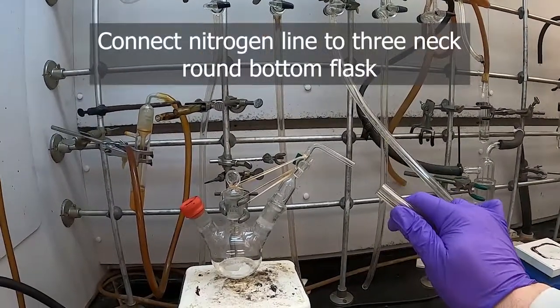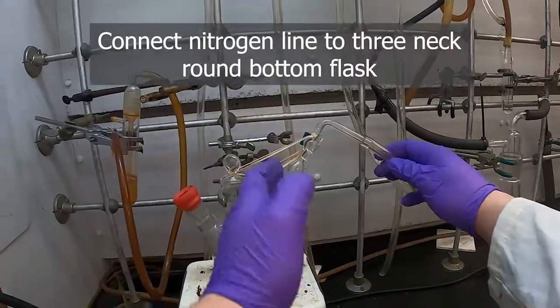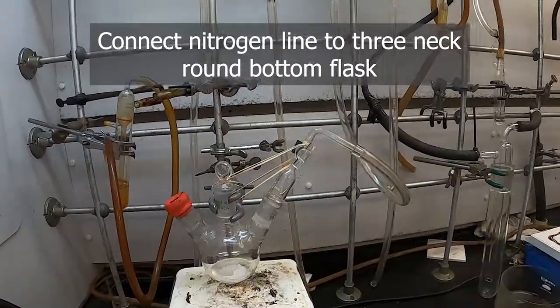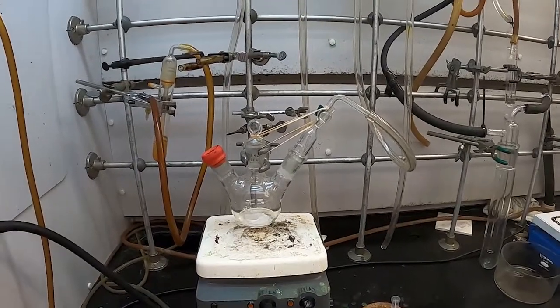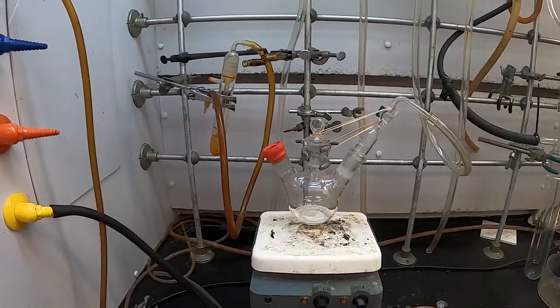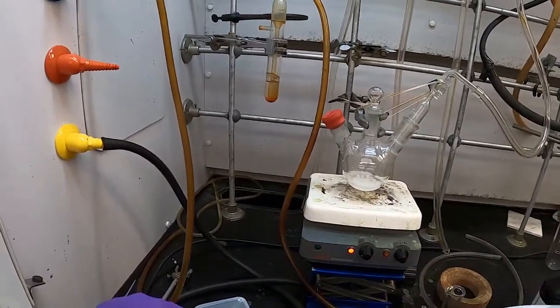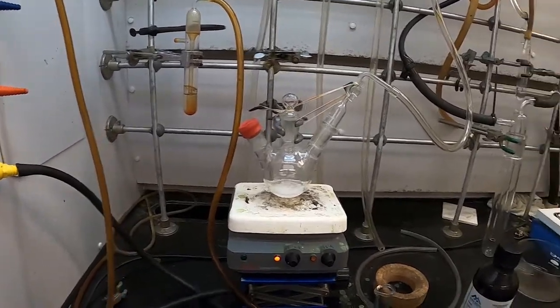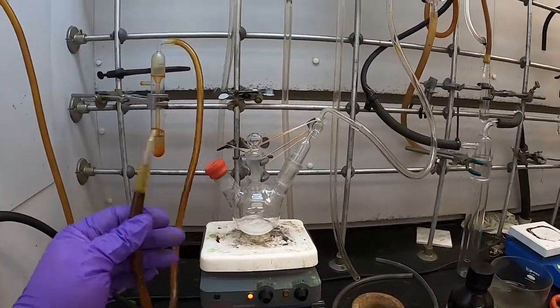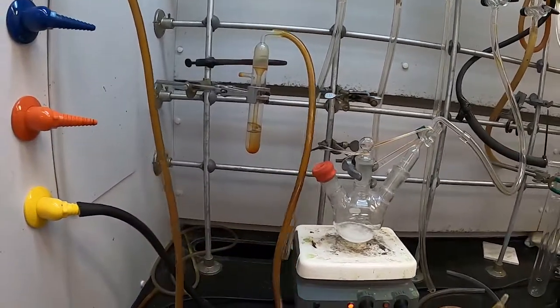And then the last piece here we'll attach is the hose here that gives us our nitrogen. You want to be careful pushing on these so that you don't break them. And the next thing we'll do is attach our bubbler here to the septum. Alright, so to complete the circuit, we will need to attach a bubbler, and we'll attach that to the end of the septum here.